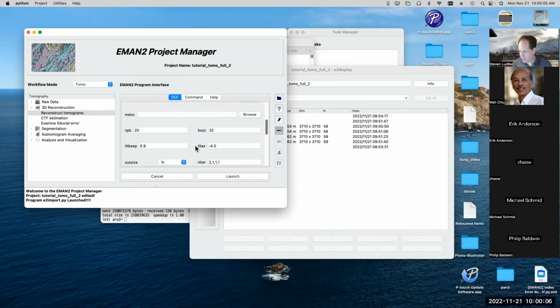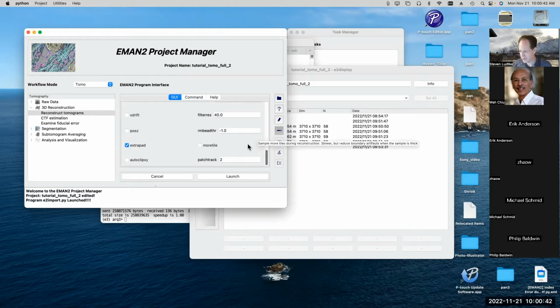The landmarks that it's finding do not need to be spherical or anything like that. Any shape is fine. They're not being used in the same way that fiducials are used in a fiducial-based alignment algorithm. They're being used in an iterative scheme along with 3D reconstruction. It's a complicated process. I have a little talk which explains how the 3D reconstruction process works, but we're not going to take the time to go through that today. The key point is that you'll see some terms here which sound like they're doing fiducial-based alignment. It's not fiducial-based. It's a different scheme.